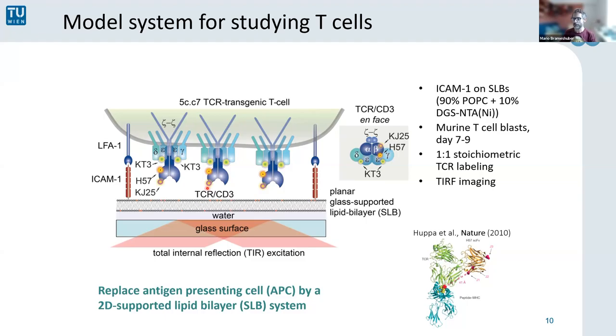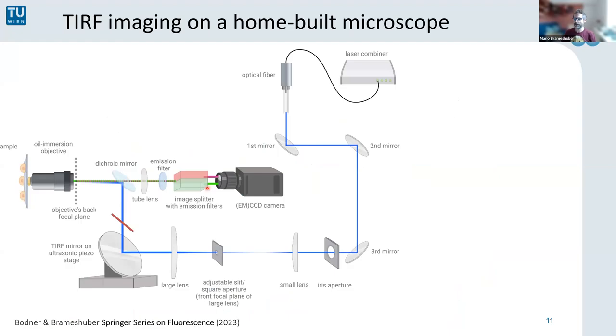To be a little bit more flexible, we built our microscopes in our lab because we're a physics lab. Just to tell you about one of the simpler setups we are using, how it is constructed, it might not differ from the setups you've seen or are using on your own. For the excitation, in this TIRF microscope we mostly use a laser combiner nowadays. Different lasers are built into a box and are coupled out via fiber coupling. We have different wavelengths in the box, and the laser is guided by variable mirrors into the back port of the microscope, and finally into the objective.